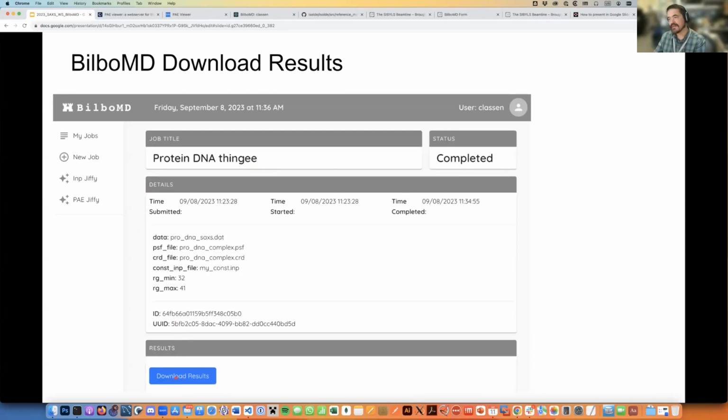If you click on that, you'll get a tarball, a .tgz file, which if you uncompress it, will have a bunch of stuff in there. I'm not going to explain it to you. Go talk to Greg, Mikkel, or Susan if you want to know all the stuff that's in there.